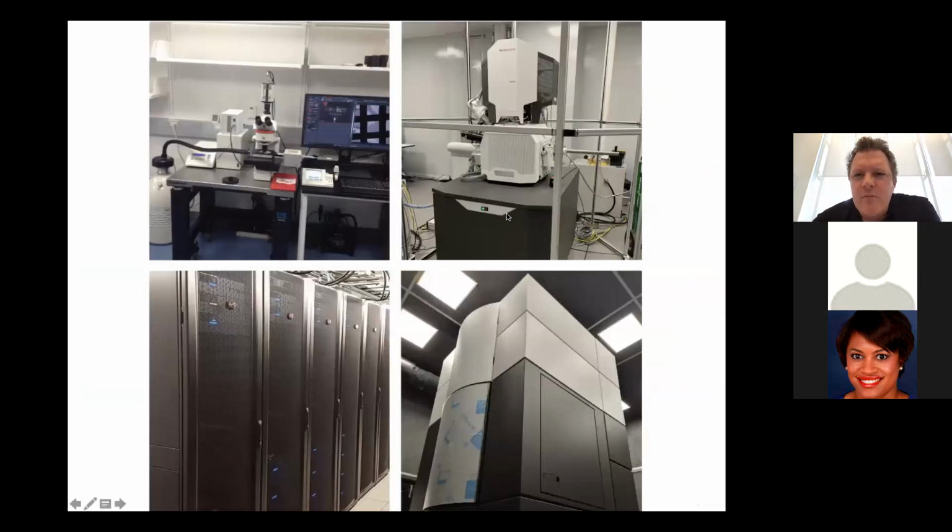And so this is what my setup looks like. Firstly, you start off by imaging your cells using a regular light microscope. The only difference is that everything now has to be kept at cryogenic temperatures so that you don't melt the ice, so we have it connected to a liquid nitrogen dewar here. Everything is being imaged under cryo conditions.